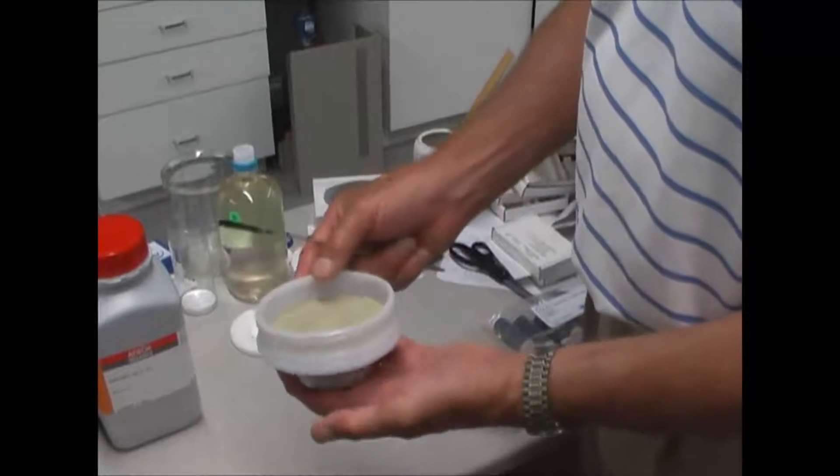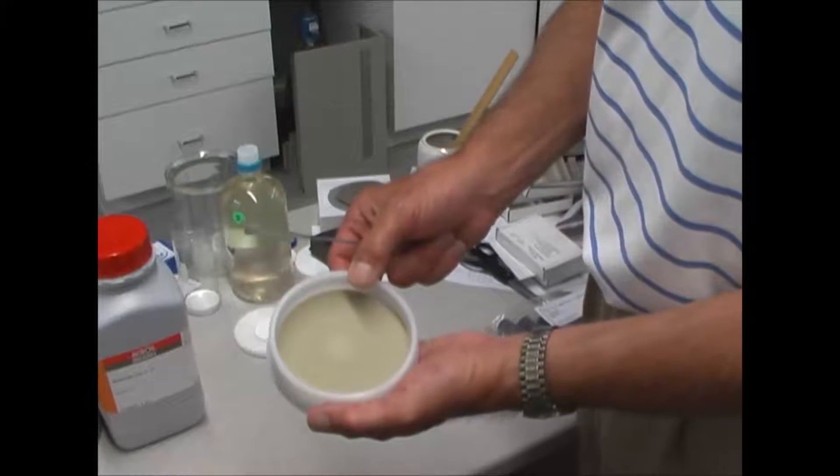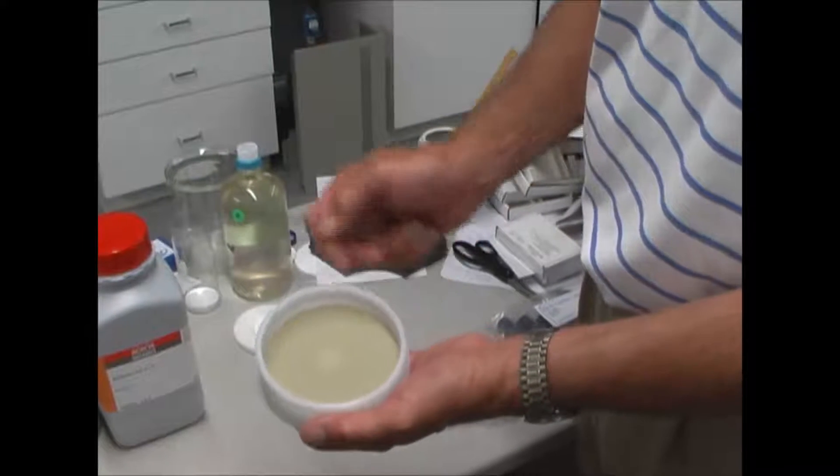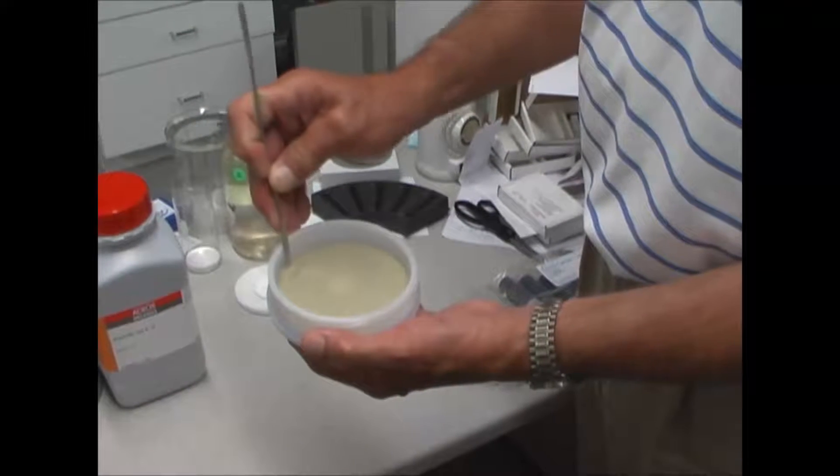So here's the disc holder that we used. Here's the pre-filter on the top. This is a five micron, and this is where we've collected most of the clay. What I'm going to do is lift the pre-filters out.